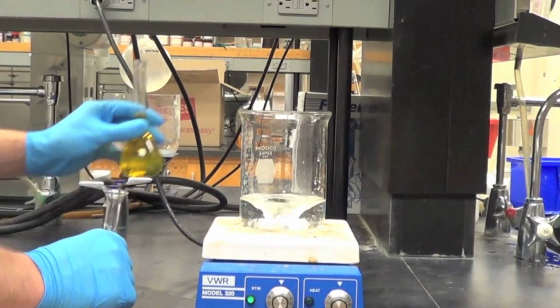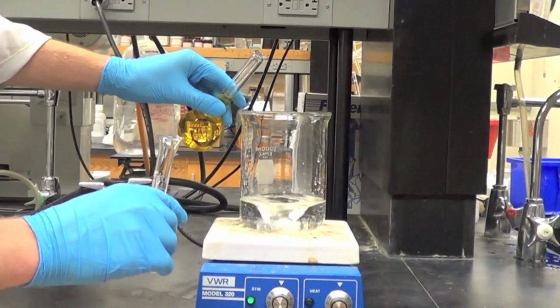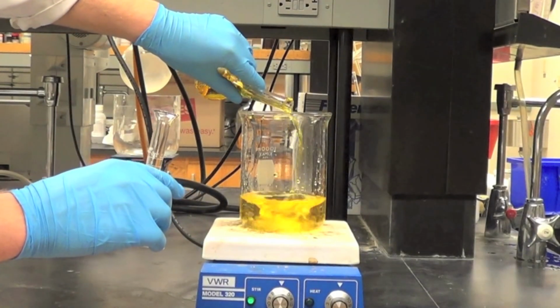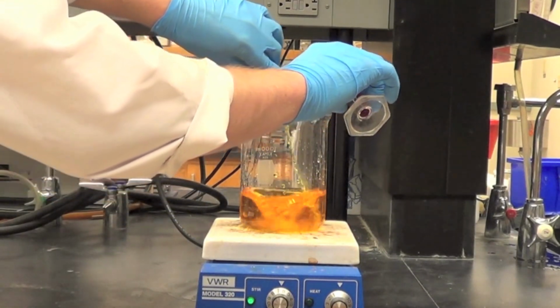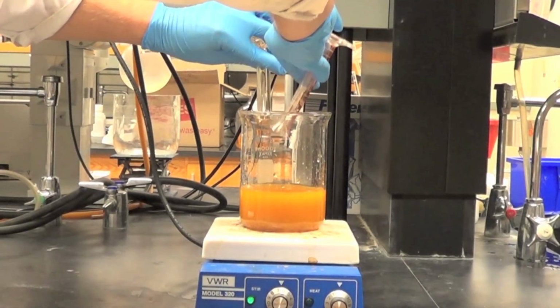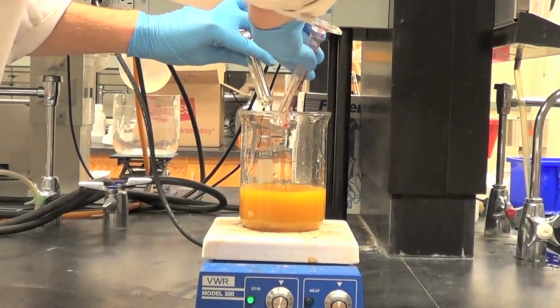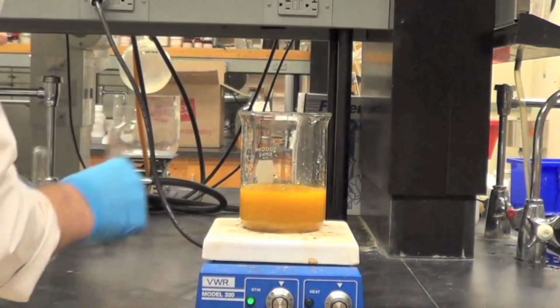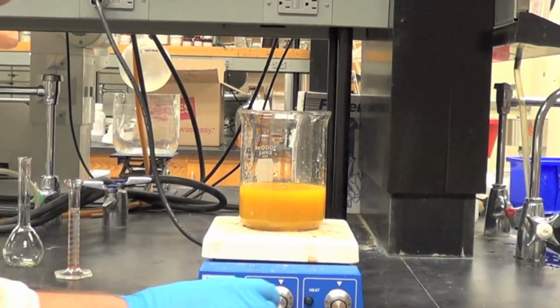Next, solutions C and ferroin are added. The mixture of the two creates a murky yellow liquid. Once it clears up, it'll turn to green and the oscillations will begin, going from green to blue to violet to red and then back to green, repeating more than 20 times.